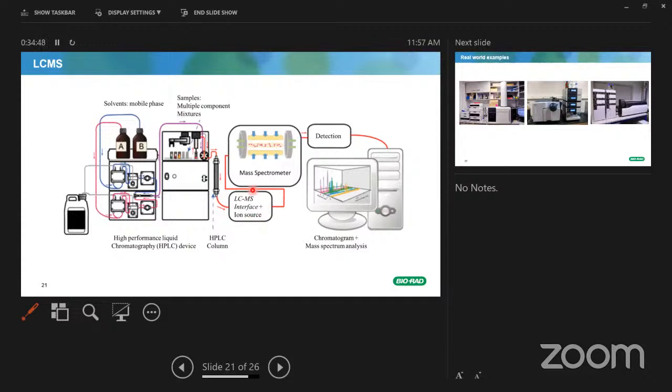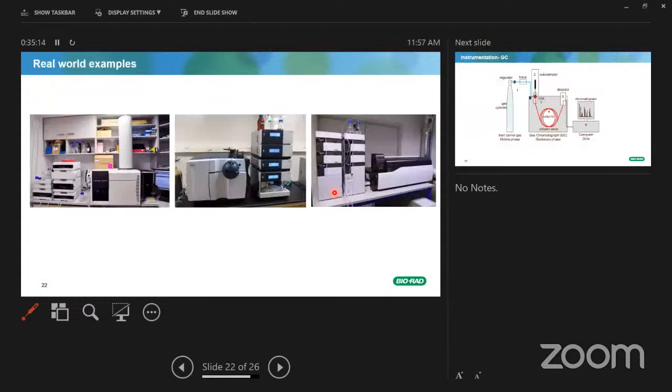Then you have the steps of ionizing, then heating, accelerating, then deflection and detection. That is the phases of the MS, and the signal is recorded. And then you have a chromatogram. Every instrument has different software which can detect the chromatogram, and then you can analyze it accordingly.